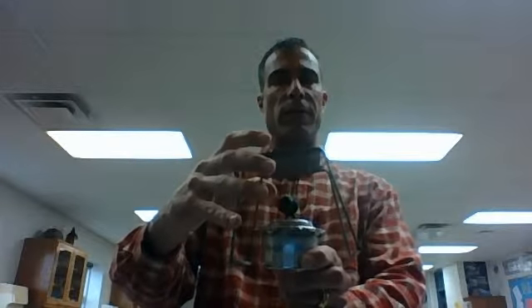Next, something that's used with the alcohol burner is a burner stand. The alcohol burner goes underneath the stand like this. This will be sitting on your desk, and then you heat beakers or things like that that are above, sitting on this burner stand. Okay, so this is a burner stand, alcohol burner.